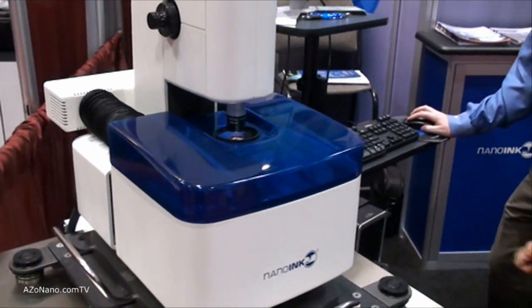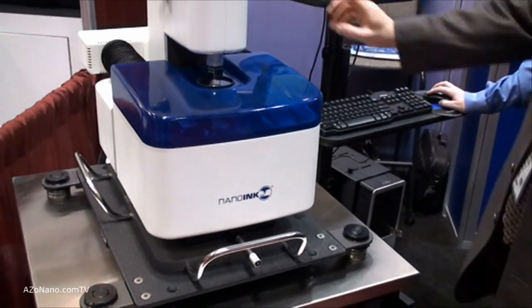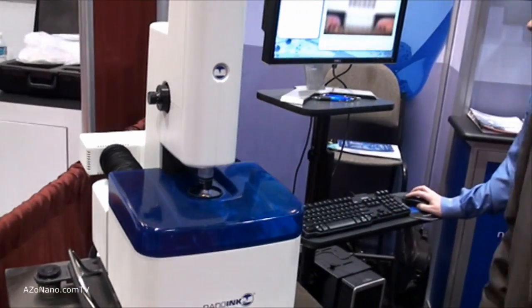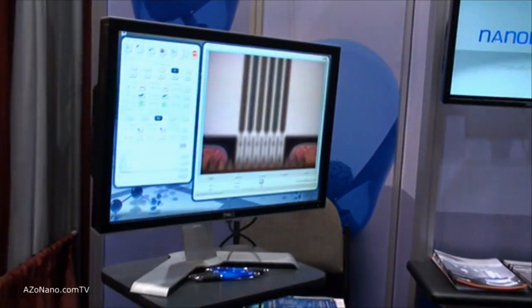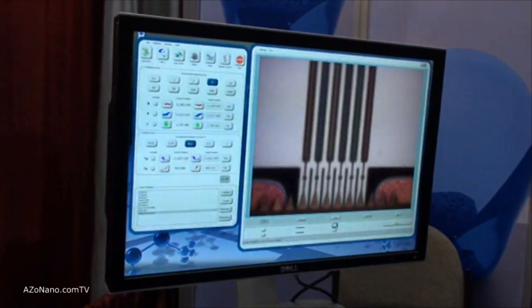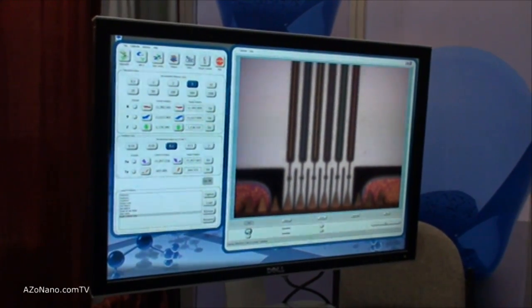Substantial mass to the system. It's very impervious to vibration. Again, very simple. Not very many controls for an operator to use. The user interface here, also keeping with the simplicity, allows the user to interact with only a few buttons to control the stage positions and the optics.